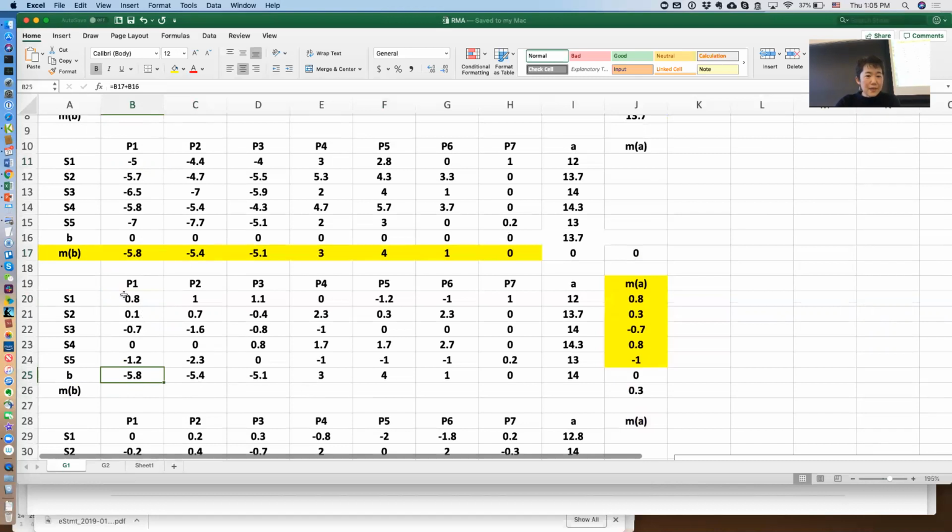And then at this level, we're going to, again, reevaluate the median of all the probes on this array. And now this is the median of all the values in here.